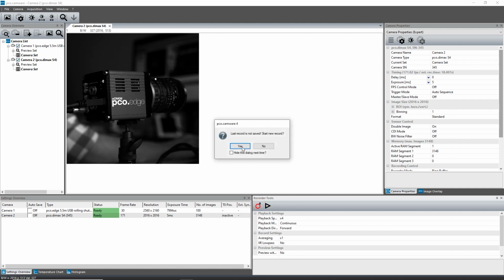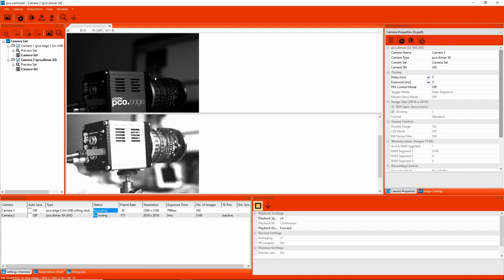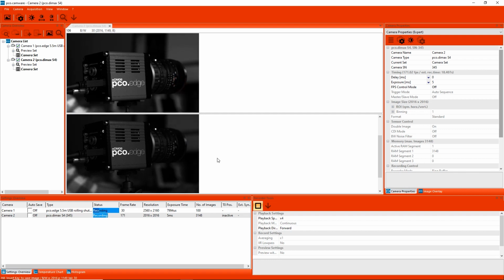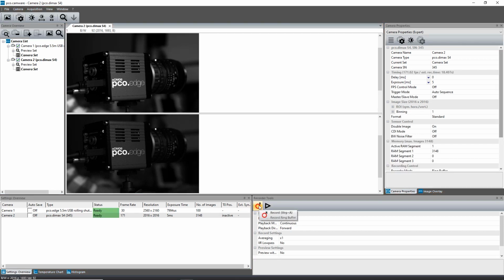The first exposure time can be any exposure time of the available range of your camera. The second exposure time can't be directly adjusted as it corresponds to the readout time of image number 1. To achieve an unblurred second image, the environment should be kept dark and the camera is perfectly illuminated with a short light pulse. The double image mode will work only in the trigger mode's auto sequence and external exposure start. Learn all about these settings in our tutorial about triggering.